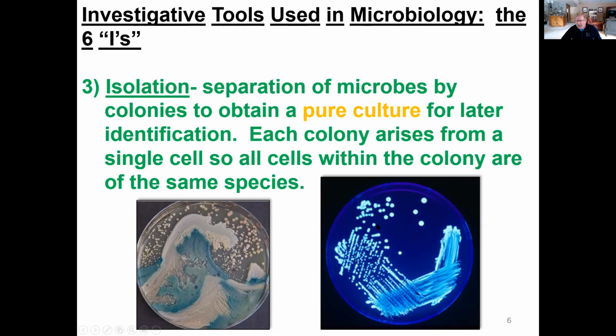and we'll talk about the methodology and technique used to do that. The goal here is to get isolated colonies, and so these circular white structures you see here are individual colonies of bacteria that arose from a single cell that was eventually spread out on that plate, and as that cell underwent binary fission and division, a few days later, it grew to a very sizable number to the point at which we can actually see it with a naked eye as this little circle. Now, this is indicating that we can then subculture this and grow it in pure culture.